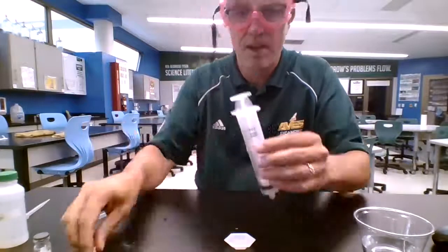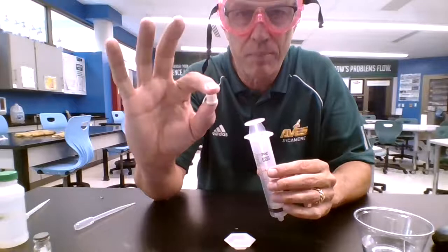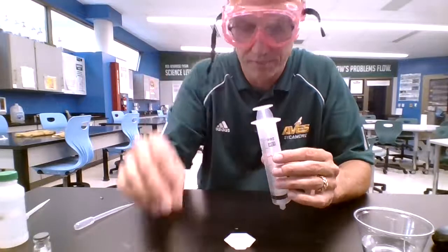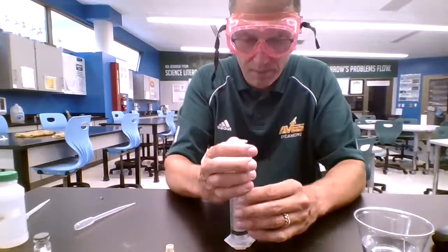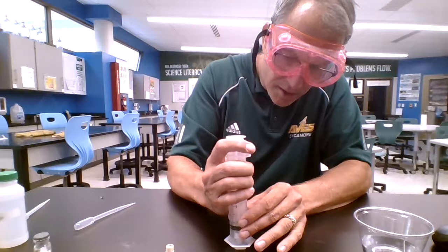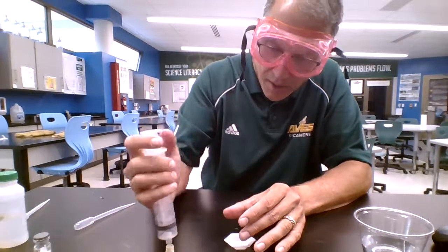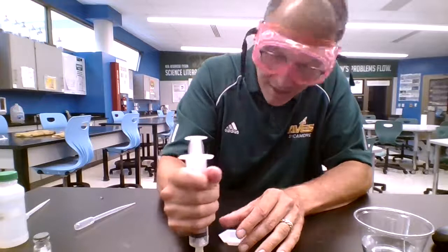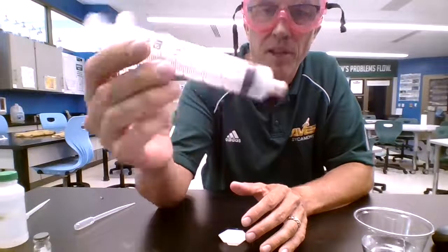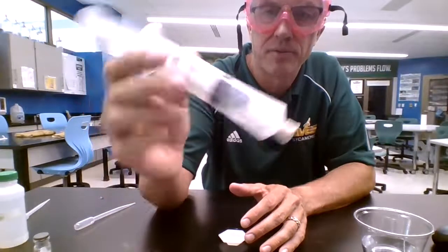Okay. Now, make sure you have your little beige cap close. This locks on to this. This is important. Take it, put it down here. I drop the vinegar. I don't want any air bubbles, as few as possible. I put it up here and I smash it down. Cap is on nice and tight. Now the fun part, ready?